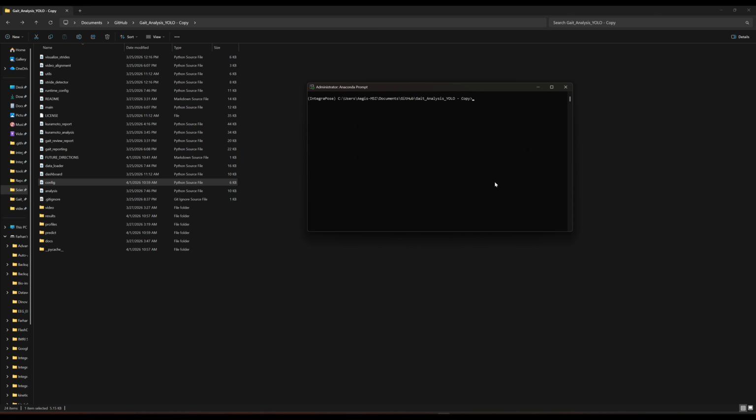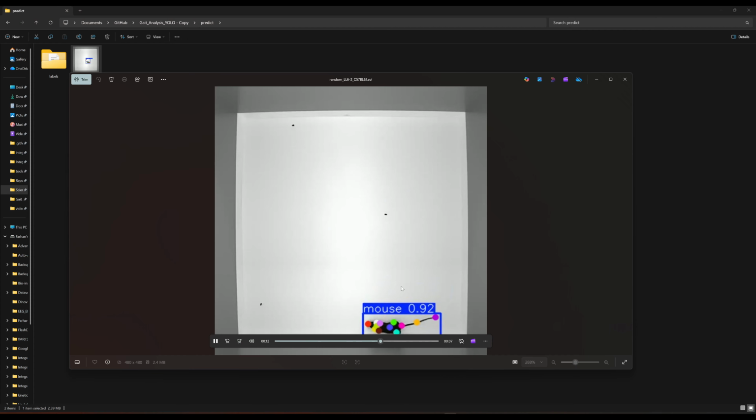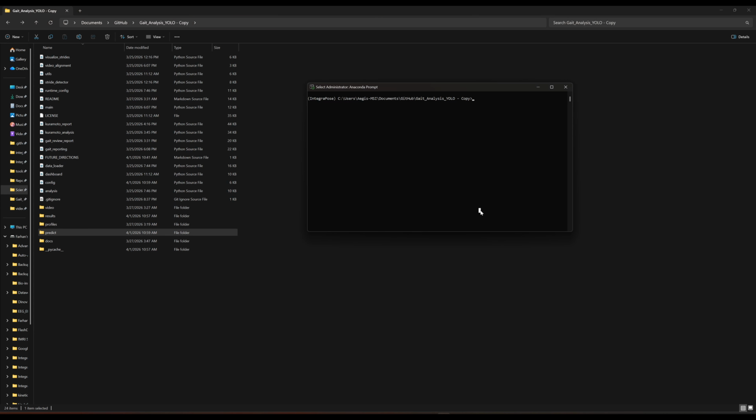Okay, so the video has been run through YOLO-Pose estimation. YOLO-Poses have been generated in the predictions. So these are the key points, and those key point estimations are saved here in these txt files. Now I'm going to run the main.py.